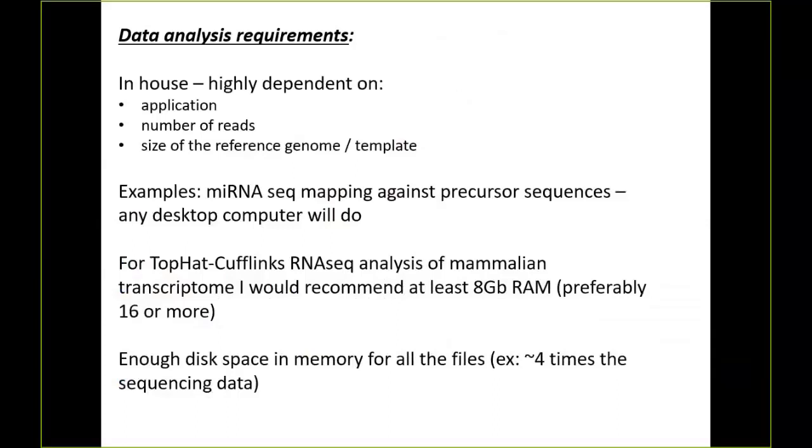All right, so your data analysis is going to be very dependent on your application. Anybody here doing microRNAs? Okay, I have one person who looks moderately interested. MicroRNAs are really cool. MicroRNAs are also really hard to prep. I've definitely seen some of the steps that go into trying to extract them from a sample, and they can be very difficult to collect. So right now, it's a little bit dark matter. We know they're there. We know they're probably important. We just don't know how to see them really well, although we're getting better at it.